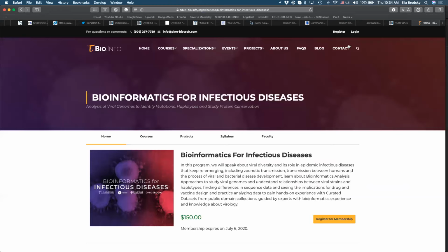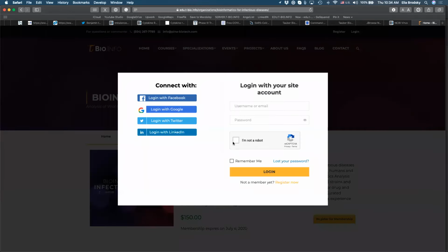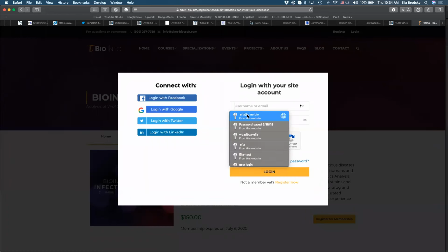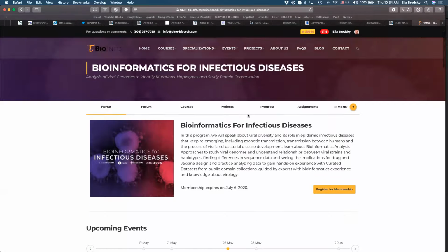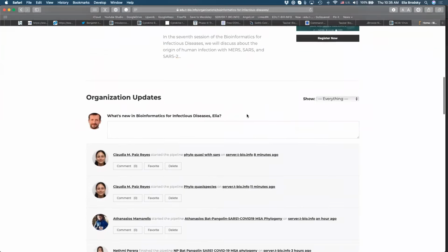What I see is that a lot of people are trying to run the pipelines. I think it's very important that we all incorporate the online materials that we discussed, because we're going to be talking briefly about gene expression today, for example. So I'll talk a little bit about bioinformatics or transcriptomic data analysis, RNA-seq. If you're not familiar with that, we have a course on RNA-seq, a collection of courses. We also have several projects that could be beneficial.